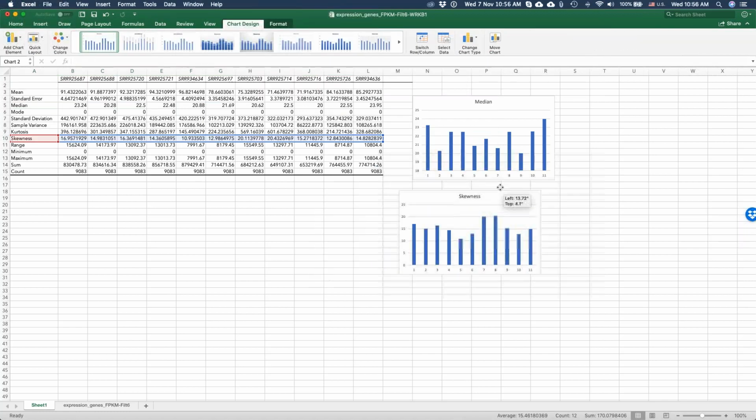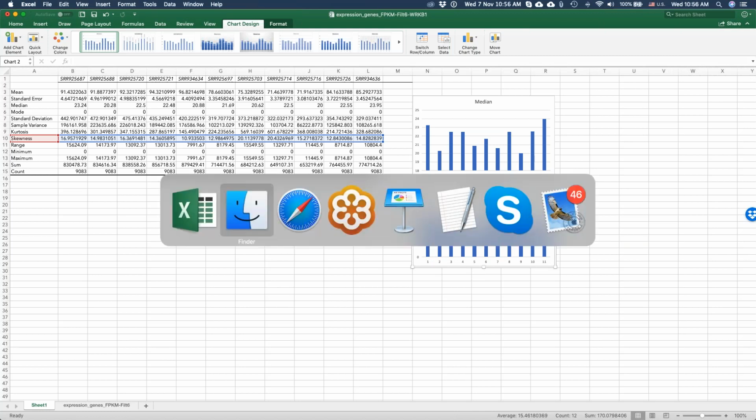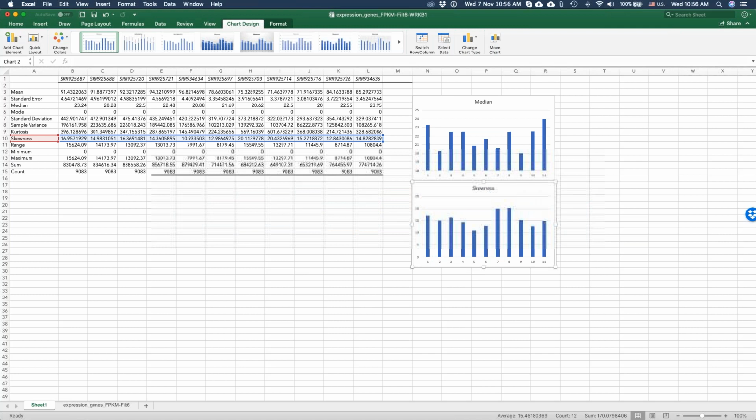And now I can see that actually they're not all distributed evenly within each sample. What happens if I do the same for my normalized data? Now as you understand what exactly this table is showing and what we did to obtain these numbers, let's go back to the prepared table.